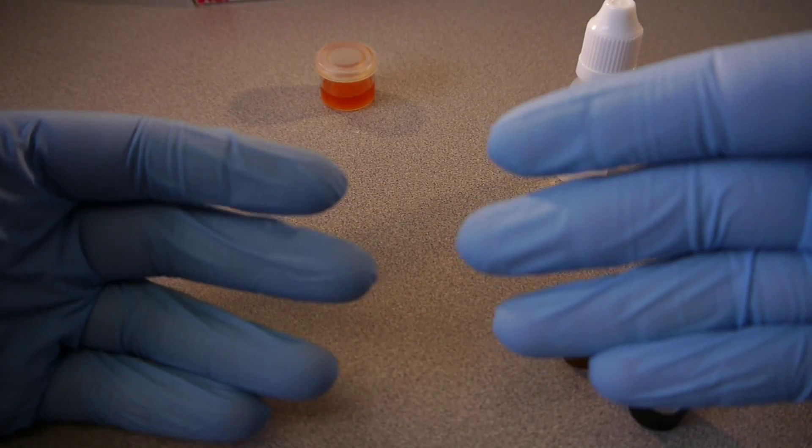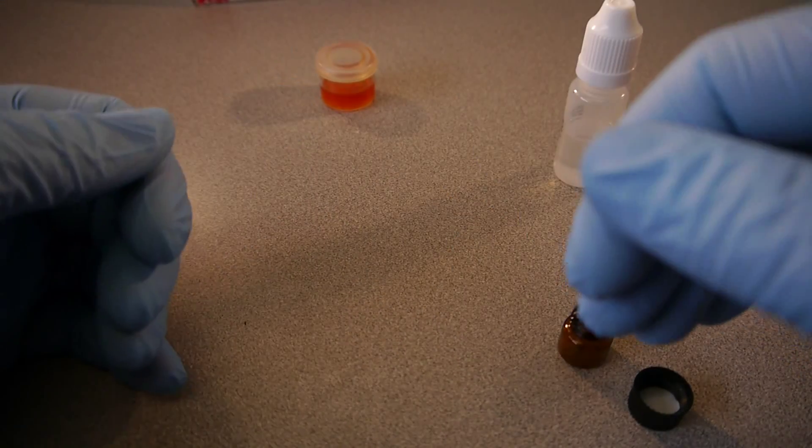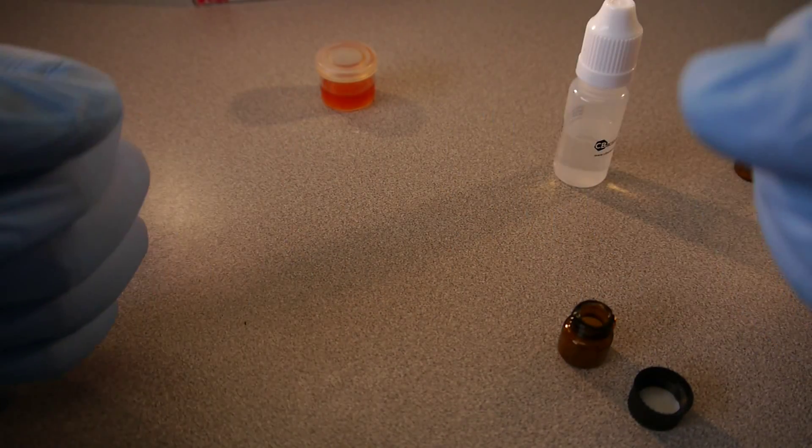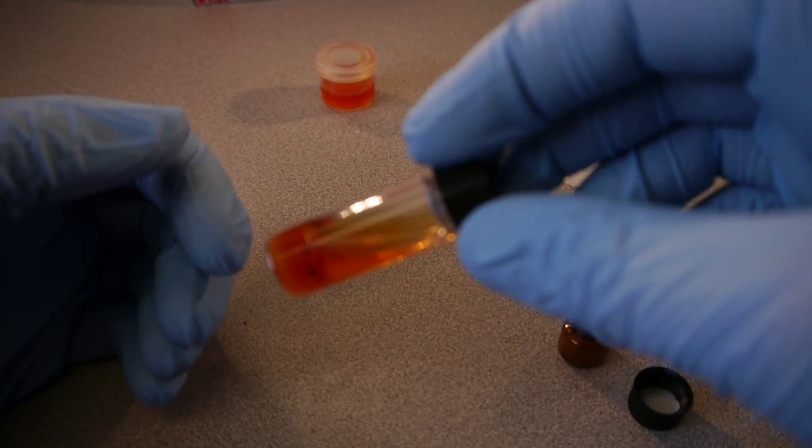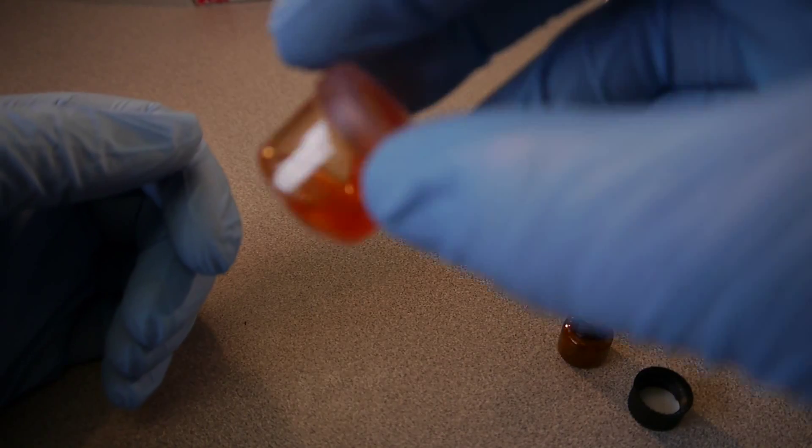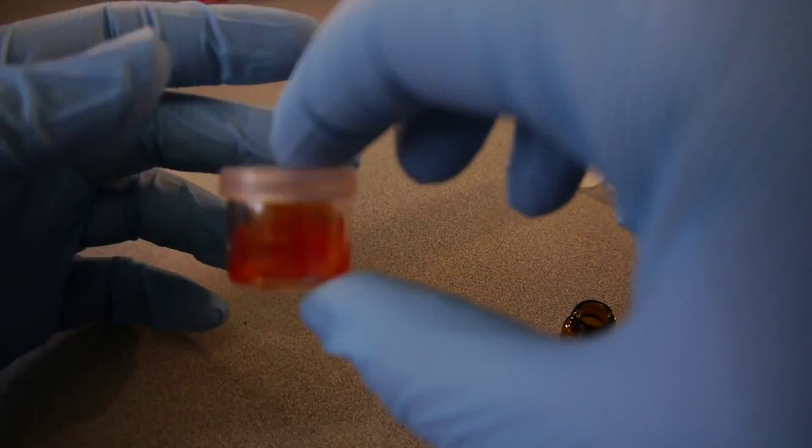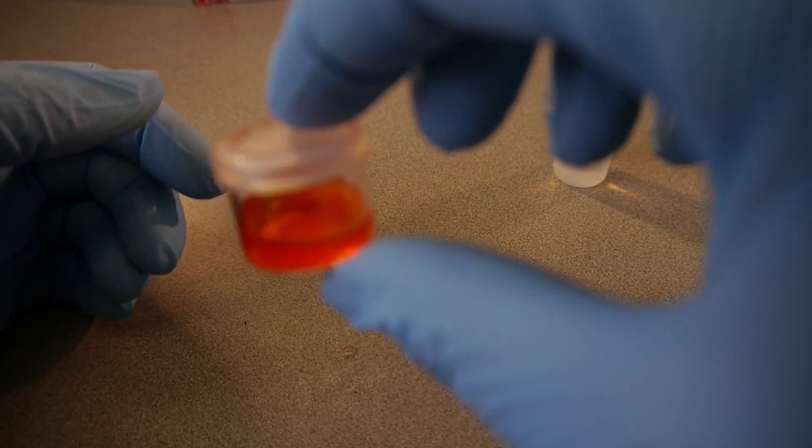And we'll let that react again, you can see it's reacting right away, since we do use a little bit more for this detection. It's a lot simpler with an edible, because when you put an edible inside this detection kit, it will take a little bit longer, since it does have to strip off the extra particles of food. This detection is already turning a darker red color, and this one will be very shortly turning a deep, deep dark red color. Again a full detection is 10 minutes.